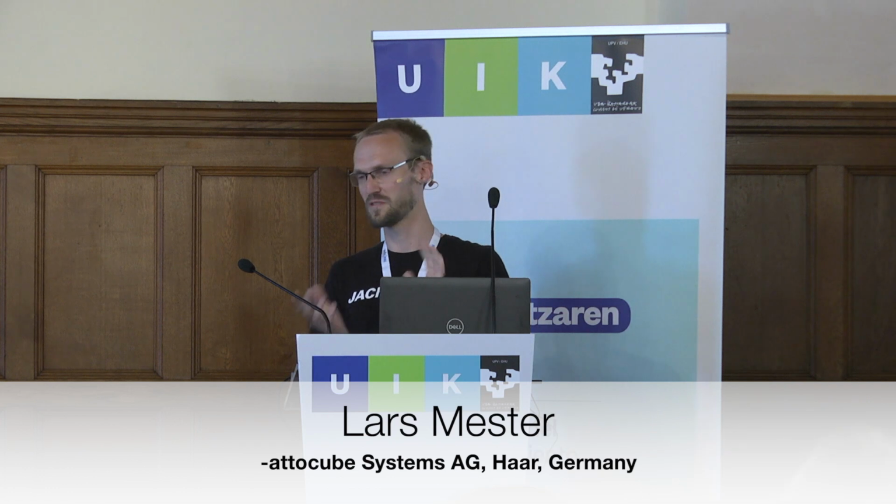So I will talk about AFM and s-SNOM data processing. So far, everything was a bit abstract and theoretical, so I thought we'd just do it live.